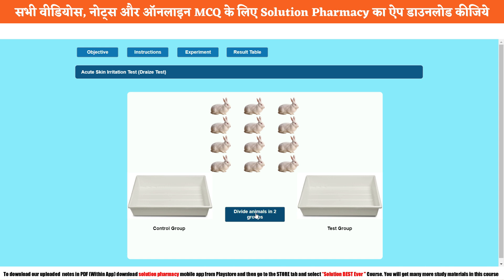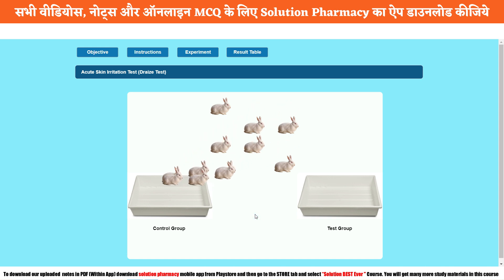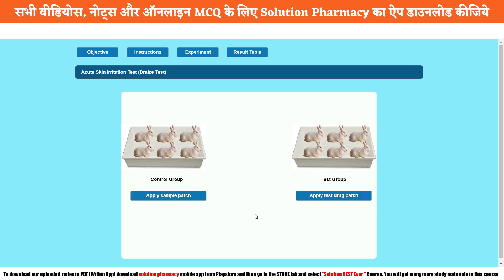We are going to divide them into two groups. The first group is the control group and the second one is the test group. Control group means we have control over it — these animals are not going to receive any kind of medicine or test substance. But in the case of the test group, they are going to receive the test substance, which is a cream or product meant for application over the skin. The control group receives only the vehicle.